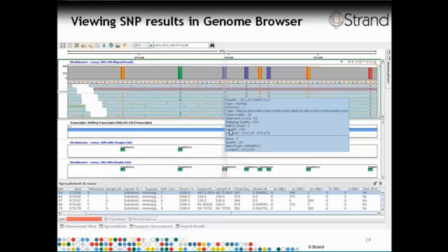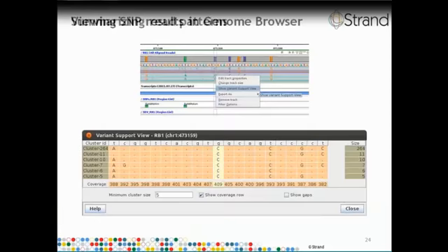The TruSeq Amplicon kit, which has recently been released, allows you to carry out high coverage sequencing of up to 384 distinct Amplicons and process 96 samples simultaneously. So if you take a look at a run folder generated by this type of analysis, it would have a huge number of files. You'll notice here that you have 4,000 files in the alignment folder. That is because we are processing 96 distinct samples, and the MiSeq alignment software generates one file for each chromosome.